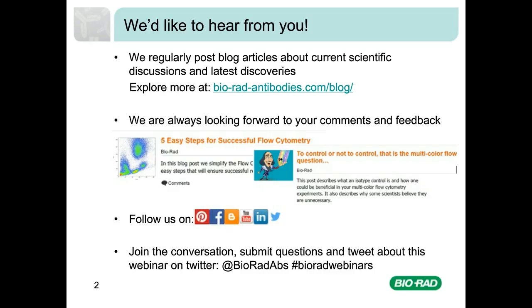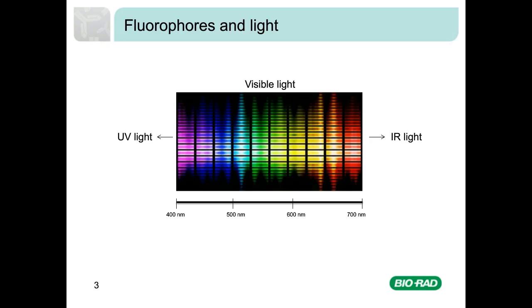Hello everyone. Welcome to this flow cytometry webinar on the subject of fluorescence and its use in flow cytometry. As I'm sure you're aware, light is a form of electromagnetic energy that travels in waves. The human eye can detect wavelengths between 390 nanometers and 700 and are observed as varying colours. Below this is ultraviolet and above is infrared light. Shorter wavelengths have more energy than longer wavelengths of light.